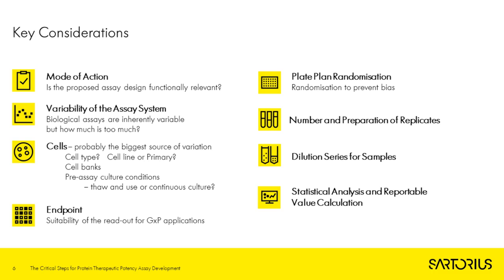To generate an accurate relative potency measurement, our sample and our reference must also be parallel. To test for parallelism, you can use the F-test, which is the preferred test in the European Pharmacopoeia, or equivalence testing, which is the approach preferred by the US Pharmacopoeia. Once we've satisfied our system suitability criteria, we can analyse the data from the run and produce our relative potency result.